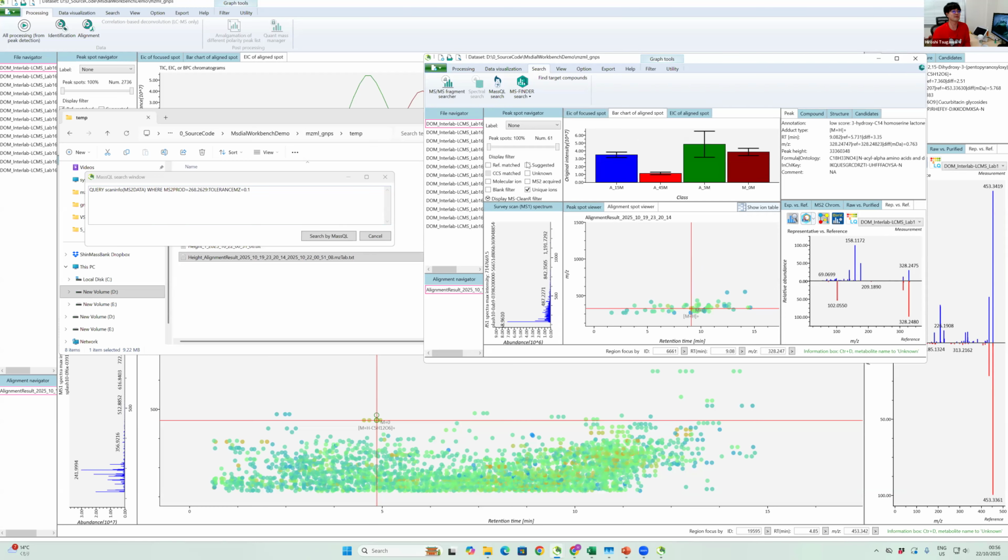Our group also supports several third-party algorithms like MS-CleanR from the European group, and Notame data post-processing from Cutting Lab.